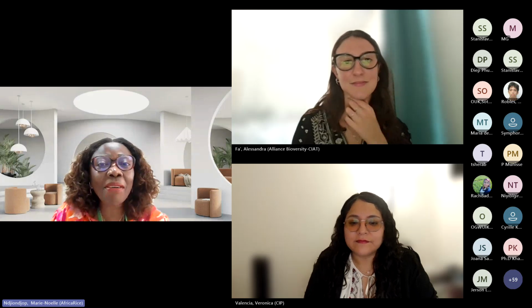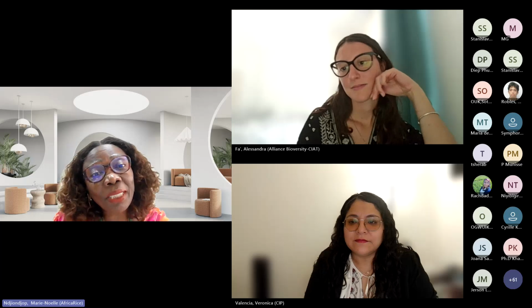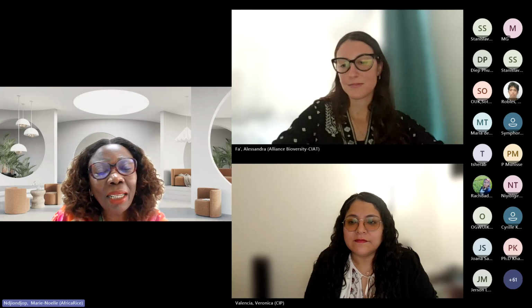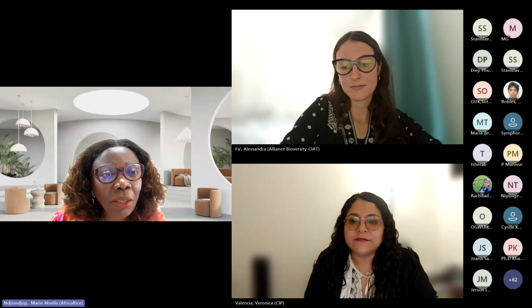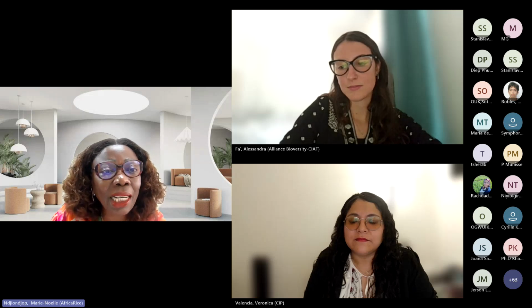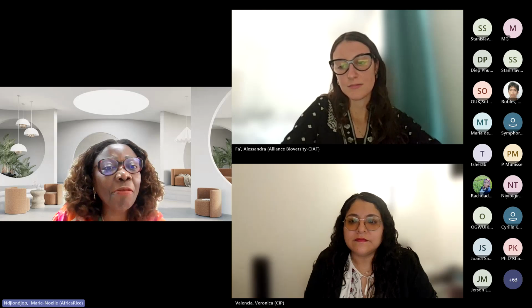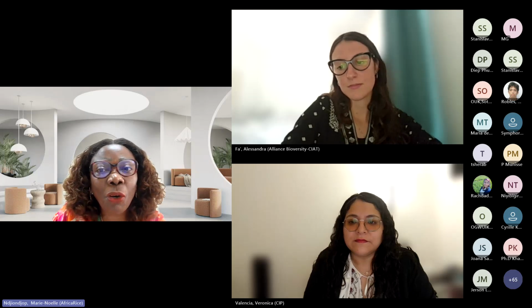So today we will have two presentations, mainly on DNA extraction. Yesterday we had the basics of molecular biology, where we talked about the DNA and the composition of the DNA. Now, today we will see how to extract the DNA from specific crops. So we have two presenters, Ronald and Verónica. They will bring us through all this protocol.